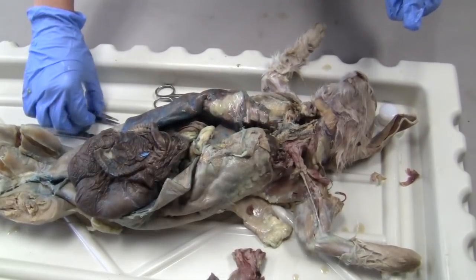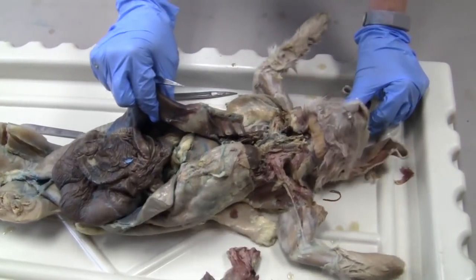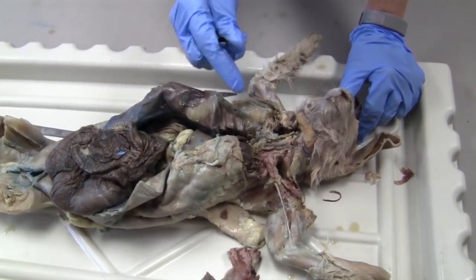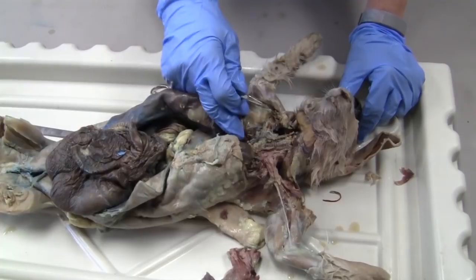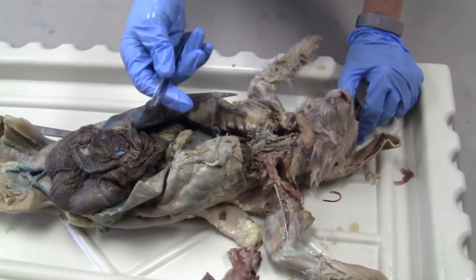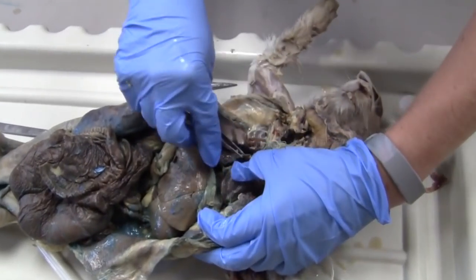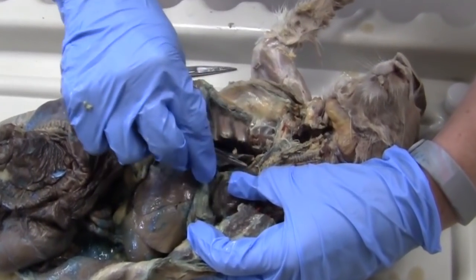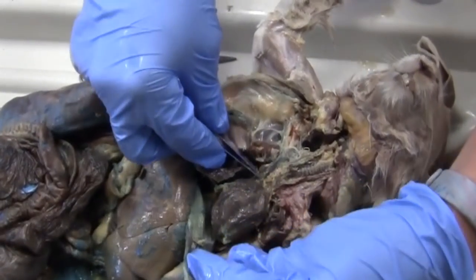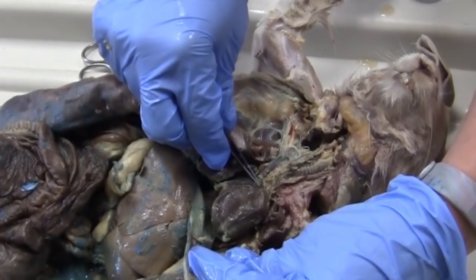So the first one, we're actually going to start with veins because my rabbit, his veins dyed very, very well. So that's what I'm going to start with. I'm sure by now, I hope you guys know the cranial and caudal vena cava. So that's where I'm going to start. I'm going to go on to the right side of the heart, and that's what I'm going to find first, is this cranial vena cava up here on the top, going into the right atrium of the heart.